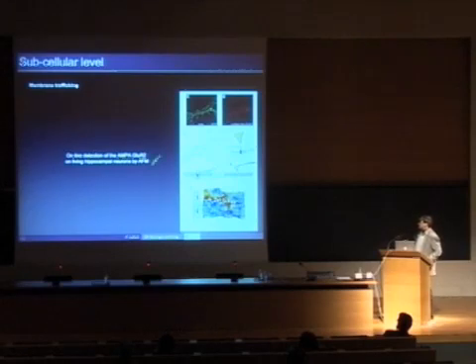And in this case, we also used hippocampal neurons that were expressing glutamate receptors coupled to an HA tag. And on the tip, we put an antibody against this HA tag. And we did more or less the same experiment as I mentioned before.